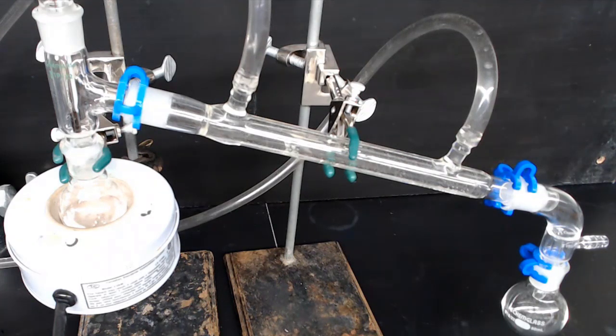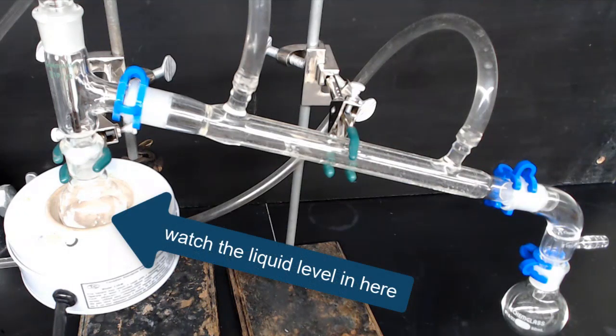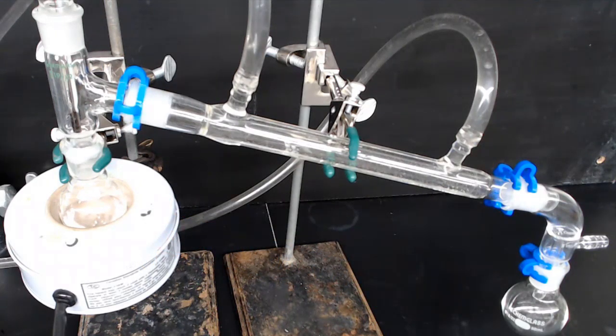The other thing you want to watch for is keep an eye on the level of the material in the distilling flask, the flask that gets hot. You don't want to distill to dryness. You don't want to keep heating the flask until there's nothing left in the bottom. You need to leave a little bit in there.